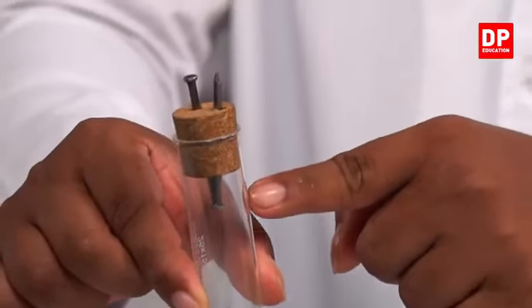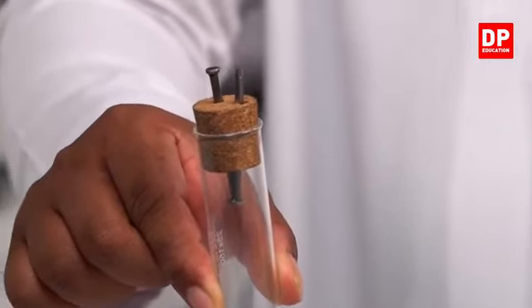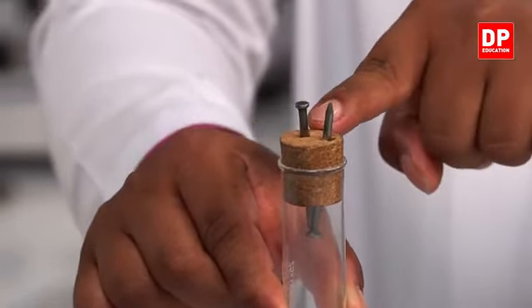Inside the boiling tube, there are some parts of iron nails, and outside the test tube also there are some parts of iron nails. Inside the test tube, you can observe calcium chloride. So we'll keep it for some days. We have to keep the system for about 2 to 3 days, and after 2 to 3 days, we'll observe what has happened to the iron nails.